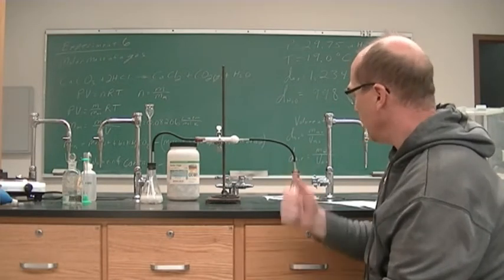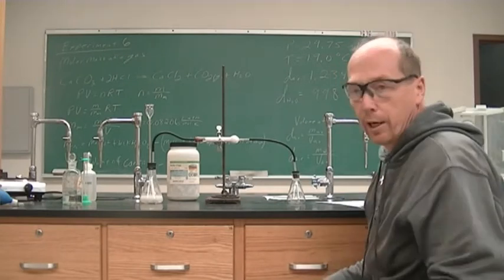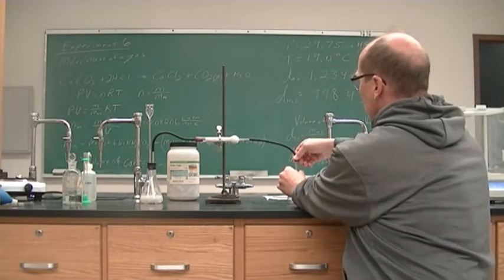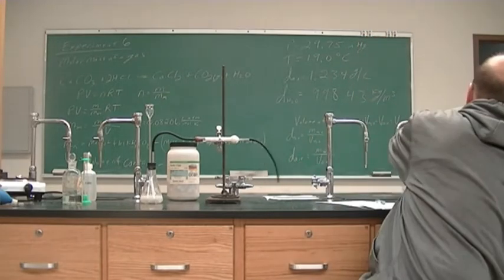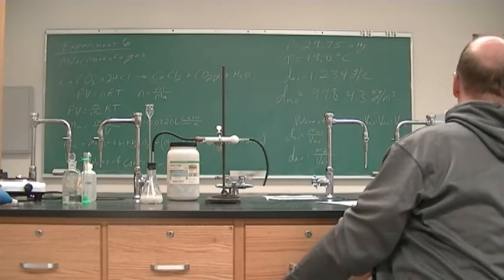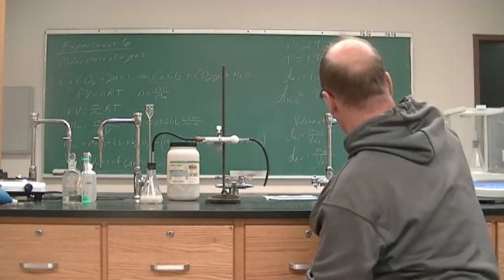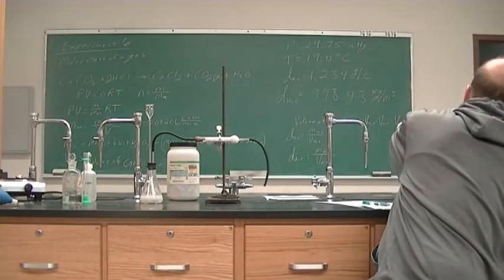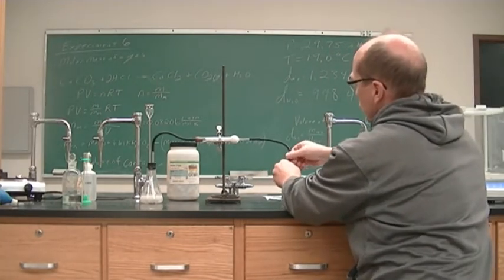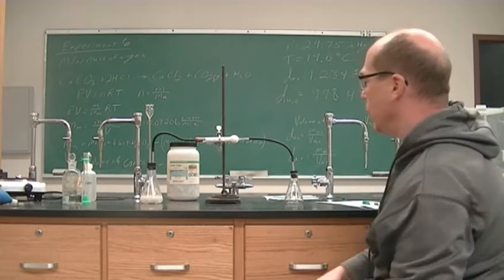All right, so I will let this go for another, well, minute or so, which it has been. And I'll check again, make sure that the mass is the same. Again, we want to make sure that it is full of CO2. All right, so now we have 69.2071, so it did go up. All right, so we will hook it up again. All right, it's still got CO2 going in there.